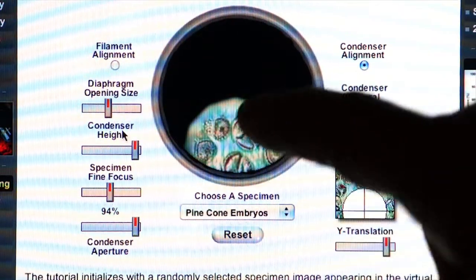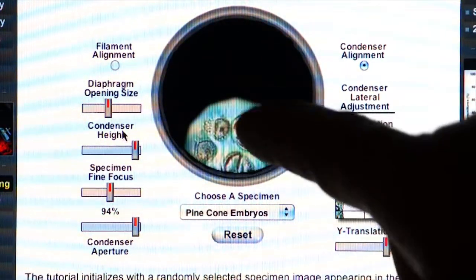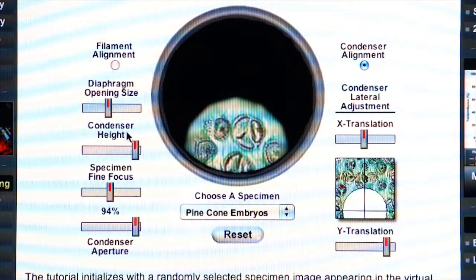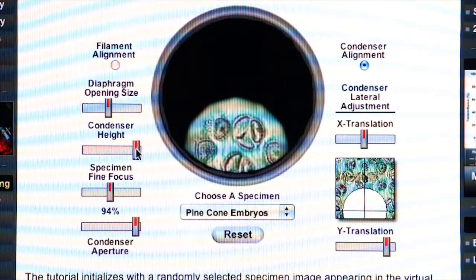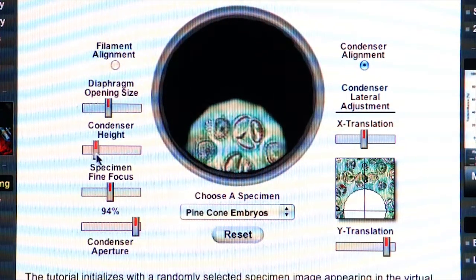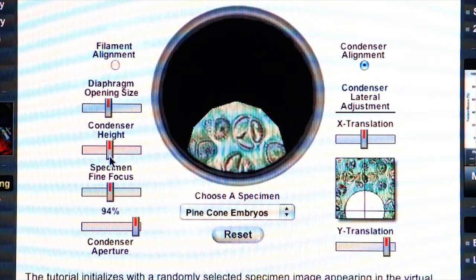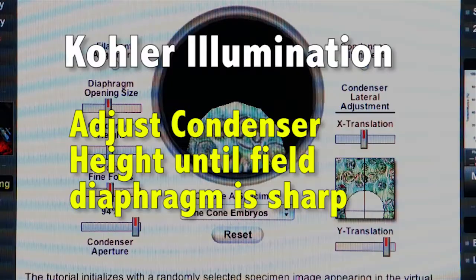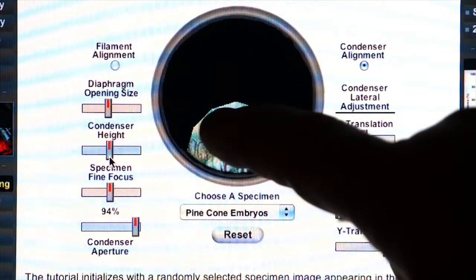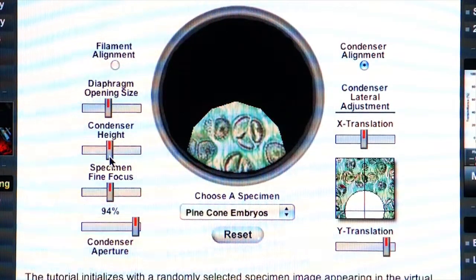It's also important that these leaves be nice and sharp. Here you can see that they're somewhat defocused. So we move the condenser height up and down until we get nice sharp leaves on the field diaphragm. Now we can see our leaves nice and sharp in the field of view.